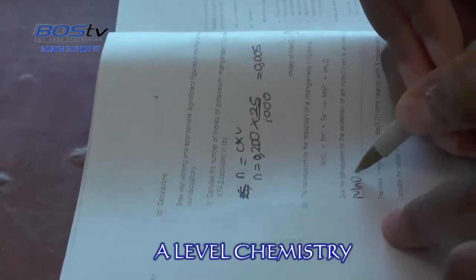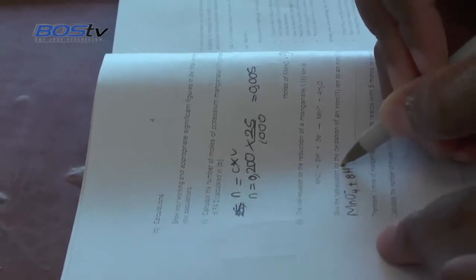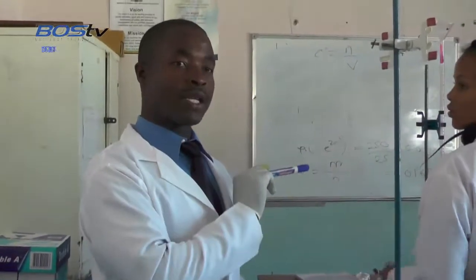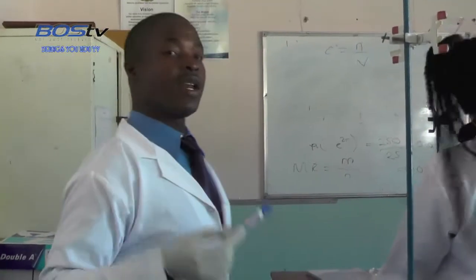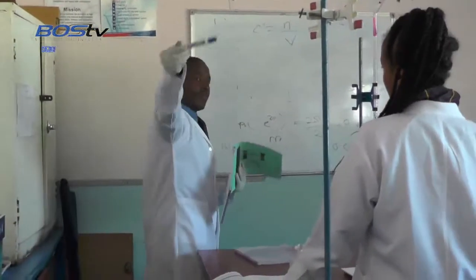That's the calculated number of moles of iron. First obtain an overall equation for part 3. Write the overall equation by adding the two half equations, one for potassium permanganate, the one for iron 2. Then from that use stoichiometry. You have the number of moles of manganese from your titration. Use the stoichiometric ratio to obtain the number of moles of iron 2 in 25 cubic centimeters. Then remember, those are in 25 cubic centimeters, but we dissolved ours in 250.